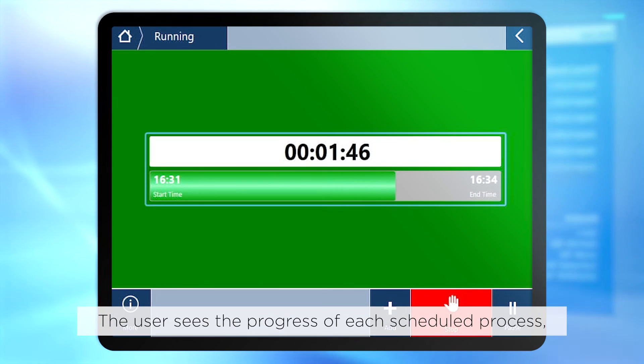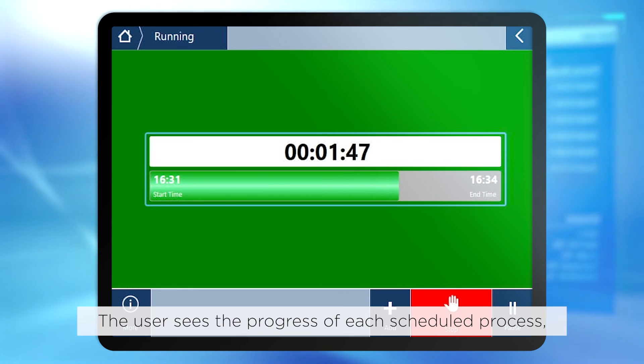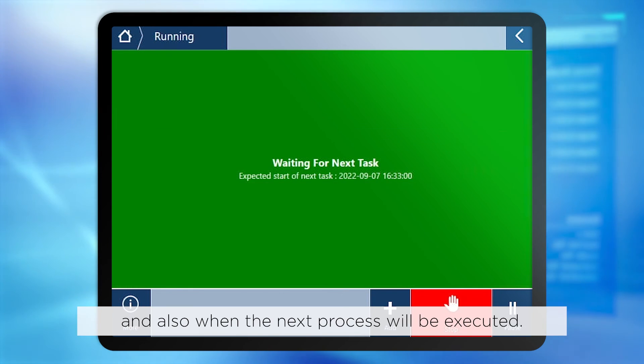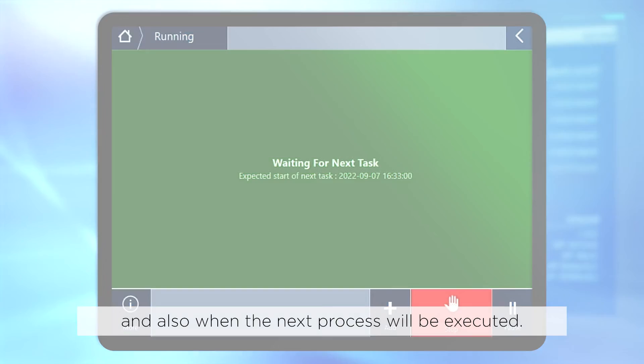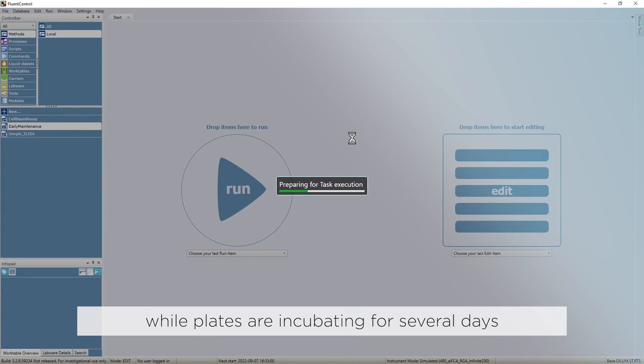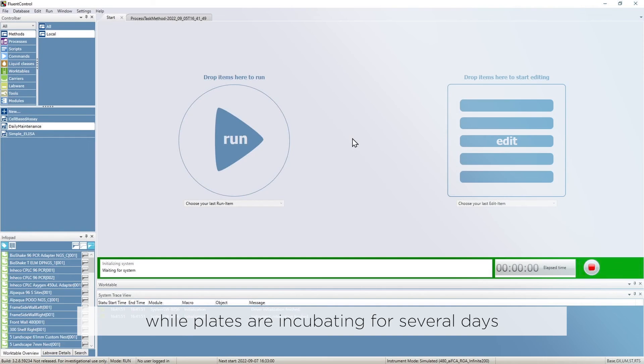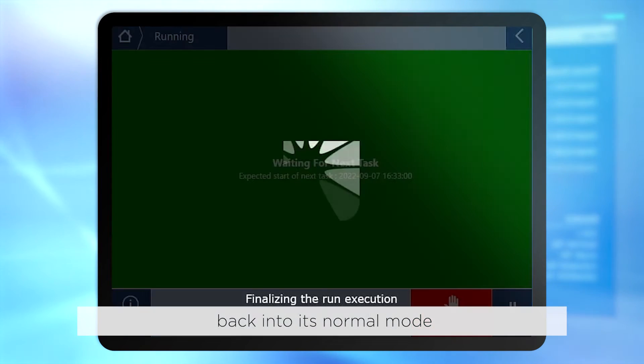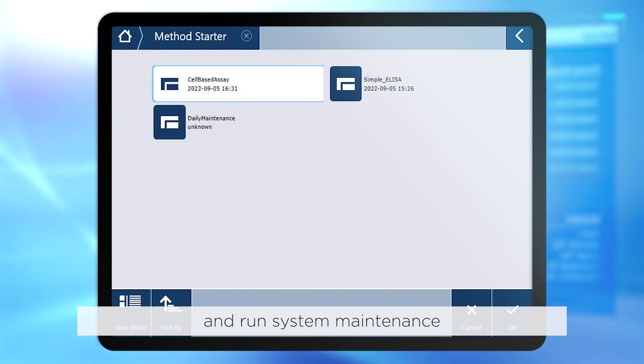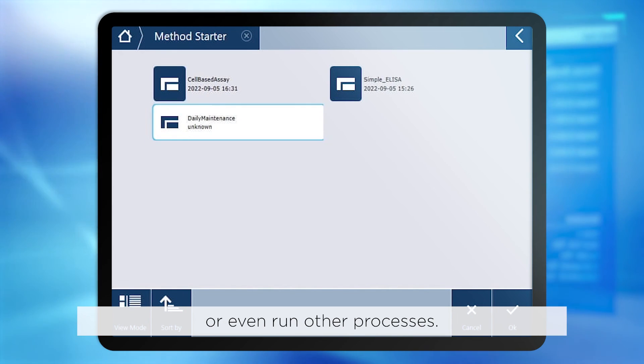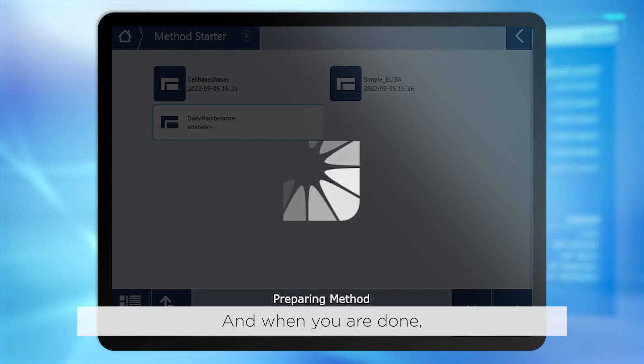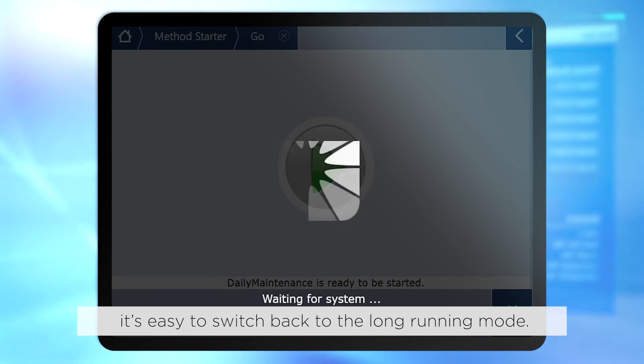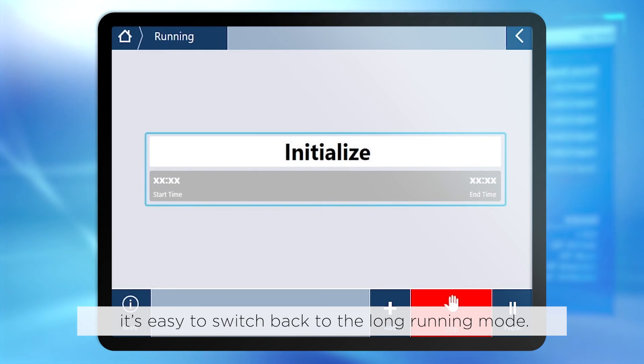The user sees the progress of each scheduled process, and also when the next process will be executed. And of course, if you want to do something else with the Fluent while plates are incubating for several days, you can switch FluentControl back into its normal mode and run system maintenance or even run other processes. And when you are done, it's easy to switch back to the long-running mode.